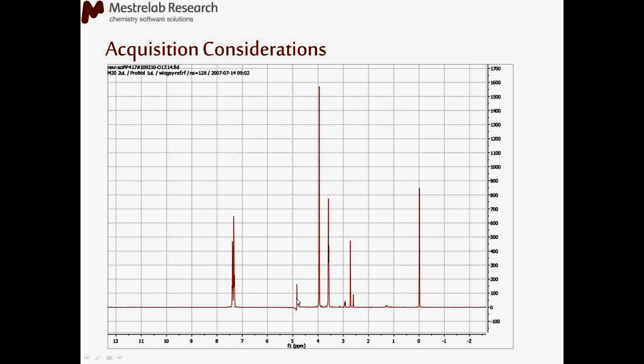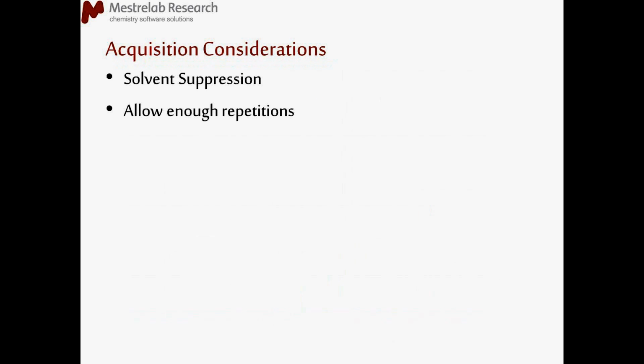I'm sure we can start a competition to see who gets the smallest residual solvent peak from the suppression. Also, allow enough repetitions. We are under constraint for instrument time, but sometimes not having enough signal to noise is really not going to help your case.